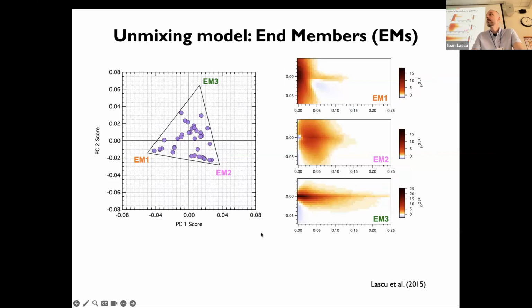Okay. Yes. What do you mean by mixing space? You mean the linear combination space? Yeah, PC? Okay. Yeah. Unfortunately, the way I set this up, we'll go to the actual software afterwards, and I'll show you exactly. But it is that space, essentially the score plot.